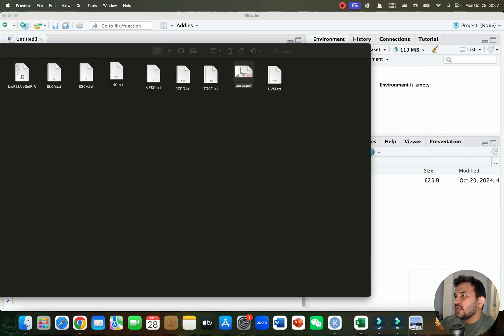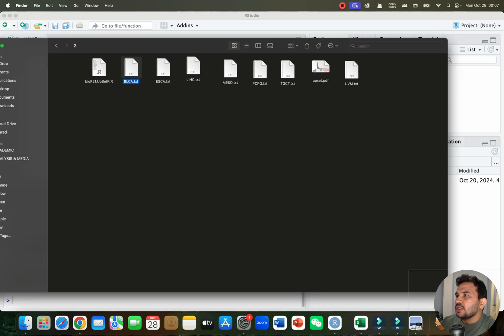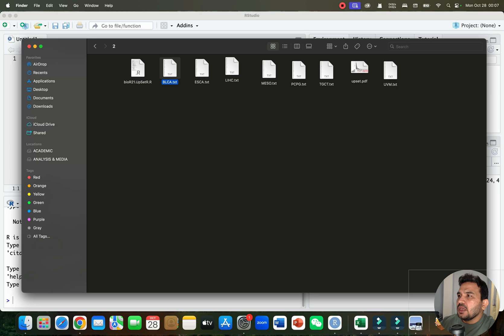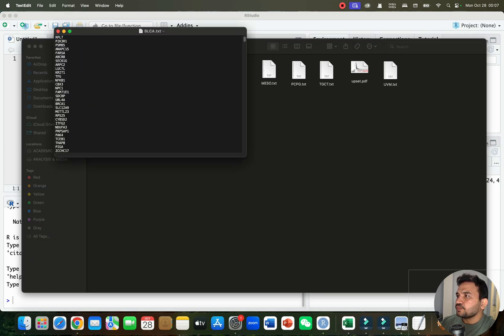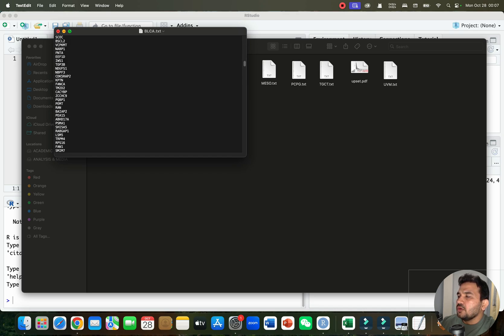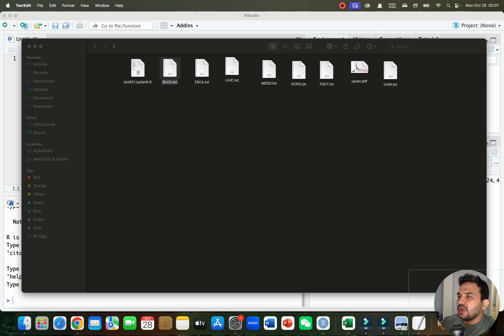Here you can see I have the different datasets — one of them is BLCA, ESCA, then LIHC. All of those files are in the form of txt files. As you can see, this is one dataset having all the list of genes in the form of text.